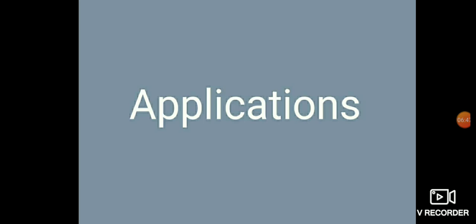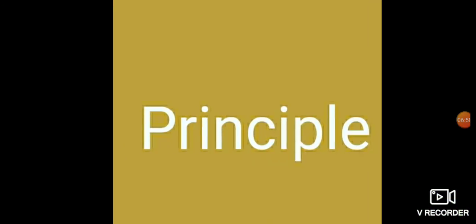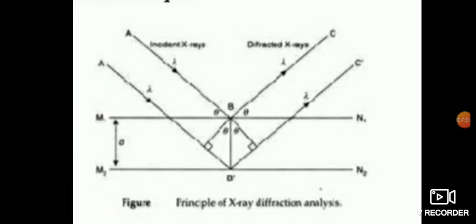Now the X-ray diffraction. The next one is X-ray diffraction. XRD effects are observed when electromagnetic radiation impinges on periodic structures with a geometrical variation on the length scale of the wavelength of the radiation. The interatomic distances in crystals and molecules amount to 0.15 to 0.4 nanometer, which corresponds in the electromagnetic spectrum with the wavelength of X-rays having photon energies between 3 and 8 kilo electron volts.